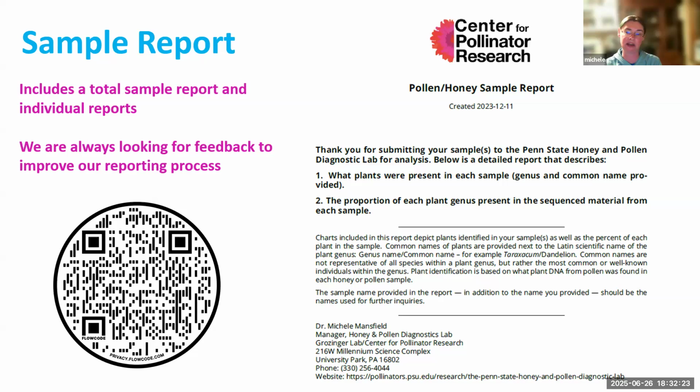And not only will it tell me what the sequence is matched with, it will tell me what percentage of reads... No. I knew my kid was going to make an appearance. But it'll tell me what proportion of the sequence reads belong to what plant. So it does many, many things at once.